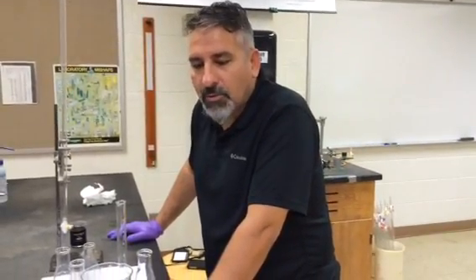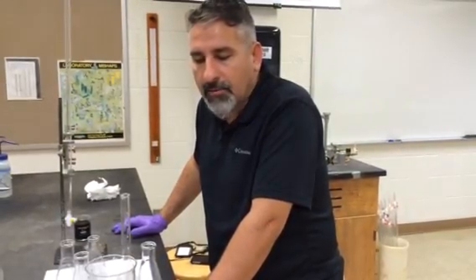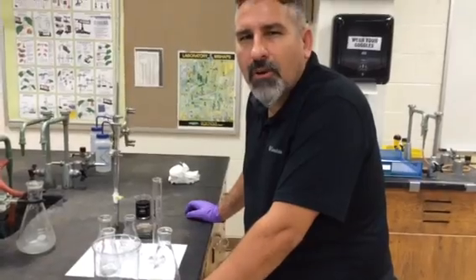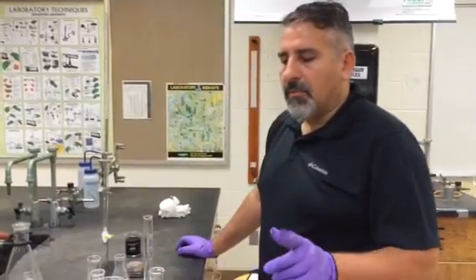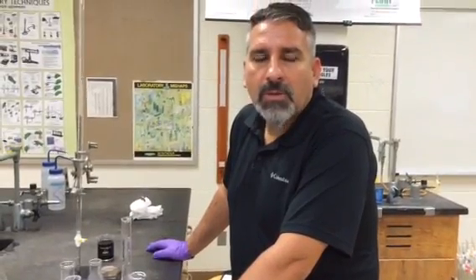Today we will be discussing the sixth experiment: the determination of iron by reaction with permanganate. This is the unknown that students are going to take. They are going to have three trials, using roughly 0.5 grams for each trial. Anything between 0.48 and 0.52 is perfectly fine — they do not have to add and remove grains. I would like to remind you that the amounts in the handout are cut by half.